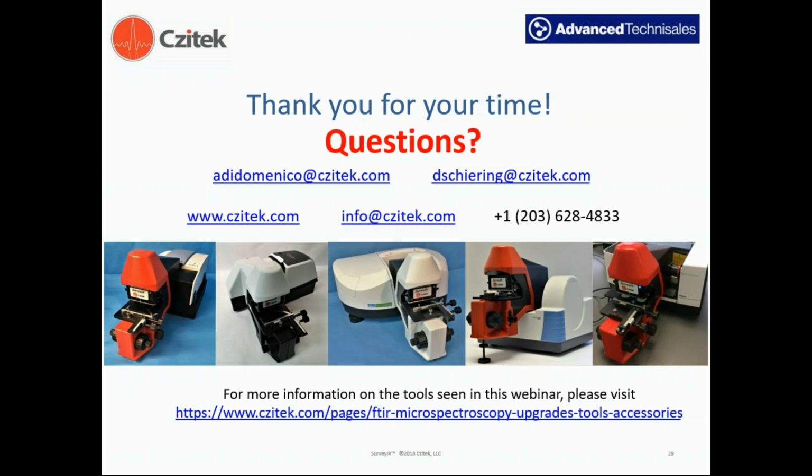Thank you. And one more question is, how does the surveyor compare to a more traditional IR microscope? One that, maybe, from Thermo or PerkinElmer.